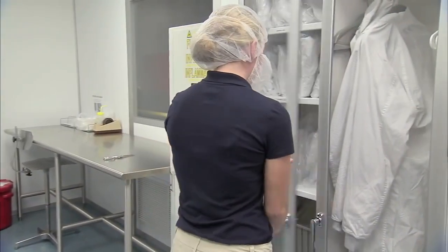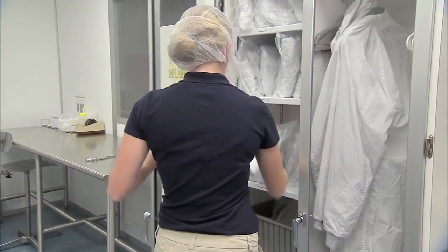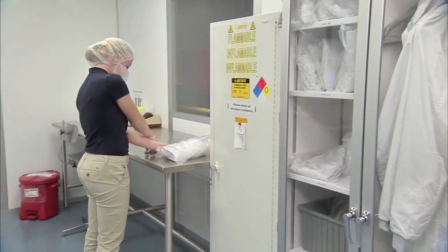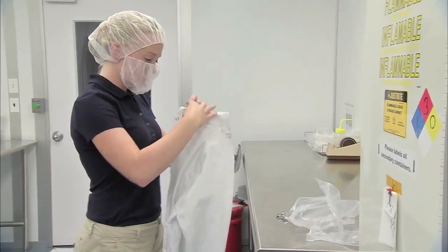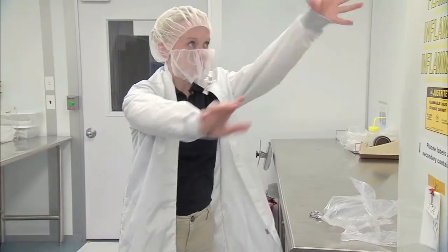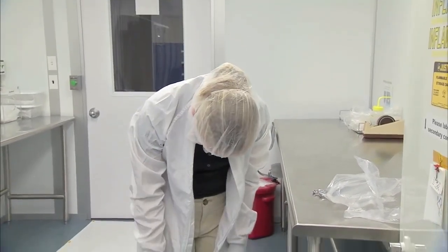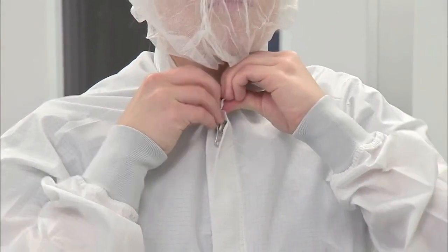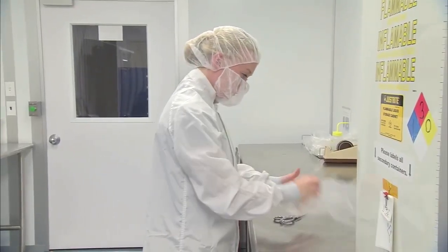Next, obtain a smock, which will usually be provided in a clean sealed bag. Cut open the bag with scissors and throw the bag in the trash. Unzip the smock and put the smock on one sleeve at a time, taking care to make sure the smock does not touch the ground or other surfaces. Zip the smock all the way up and secure any snaps at the neck. Be sure to choose a smock size that fits comfortably, not too big and not too small.